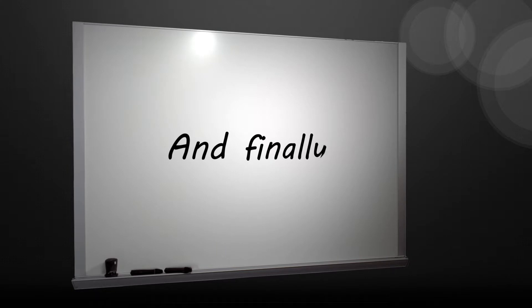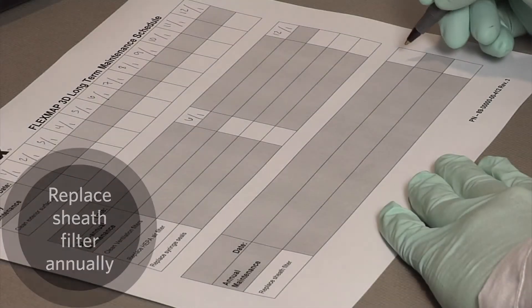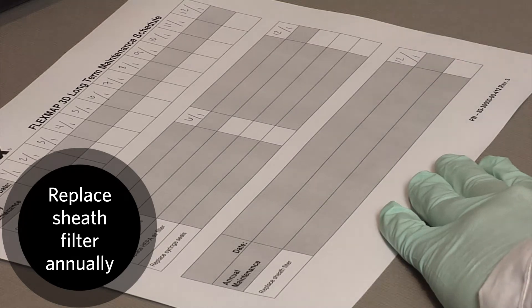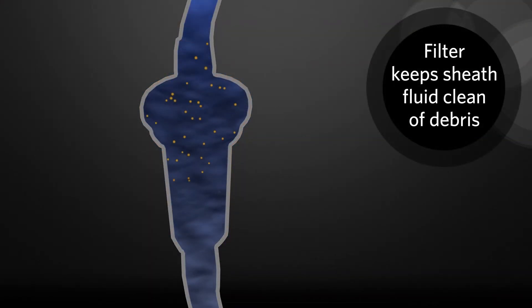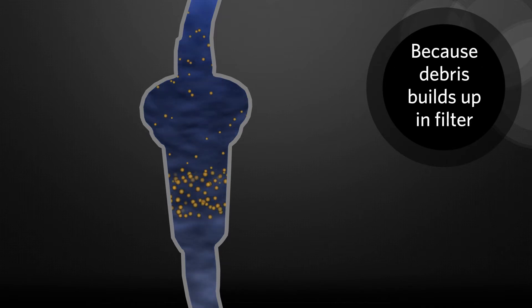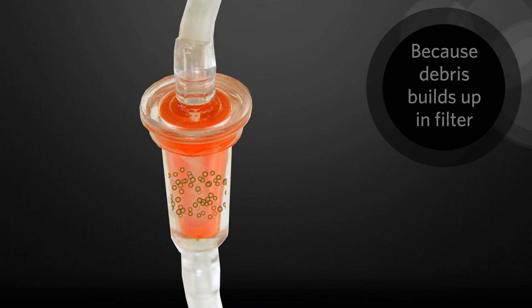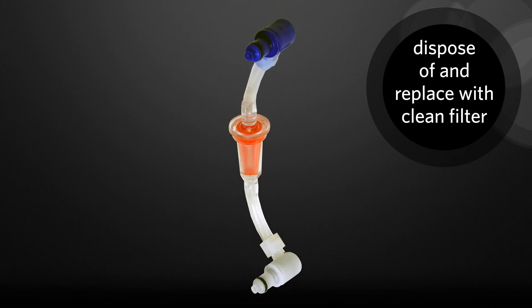And finally, remember: replacing the sheath filter on the FlexMap 3D instrument needs to be completed annually. This filter keeps the sheath fluid clean of debris. Because the buildup remains in the filter, it must be disposed of and replaced with a clean filter.